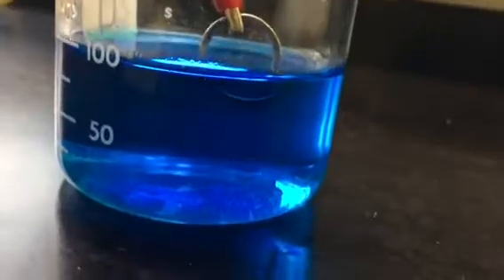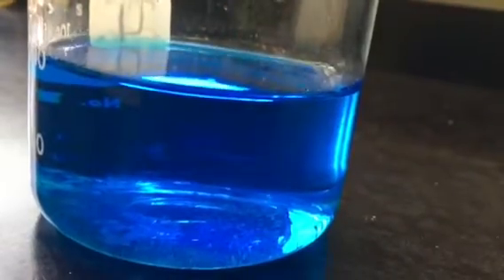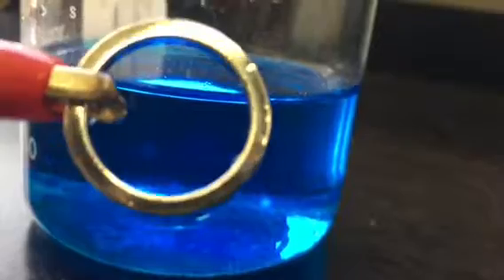In this video, the ring is not attached to a battery and there is no copper anode. As you can see, without the battery attached, no copper is being plated onto the ring because the reduction of copper is not spontaneous on its own.